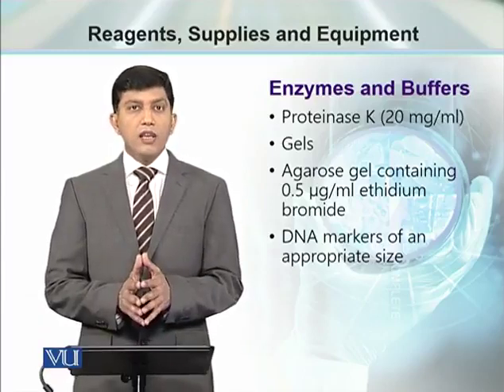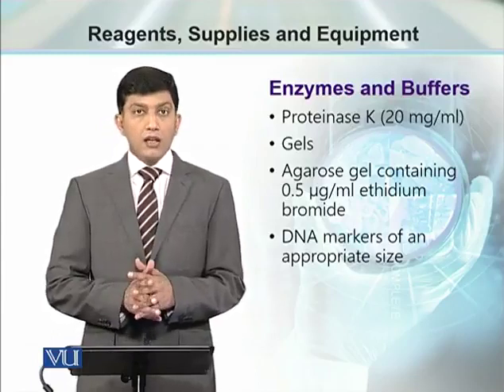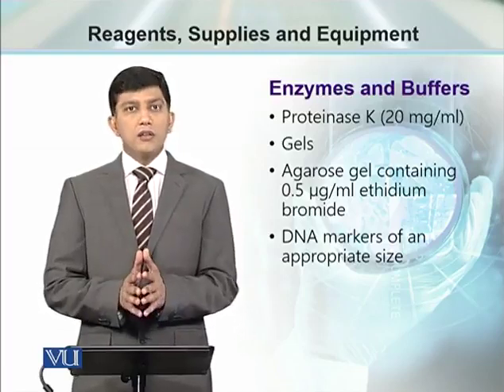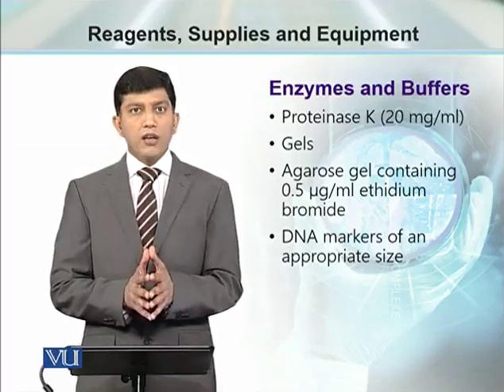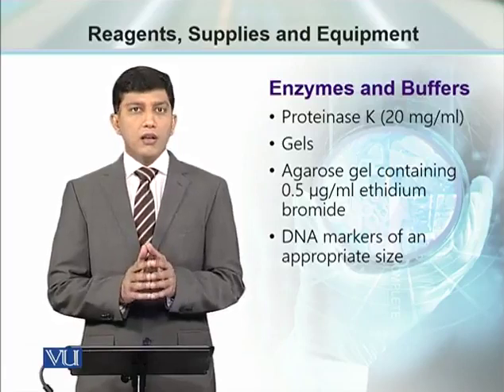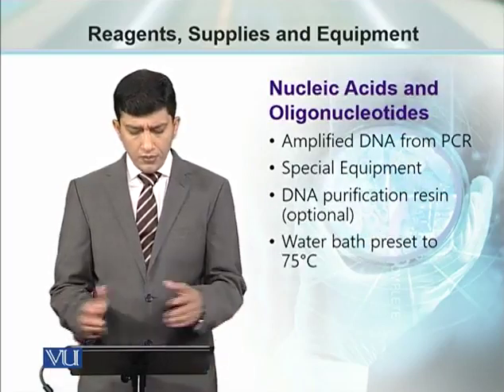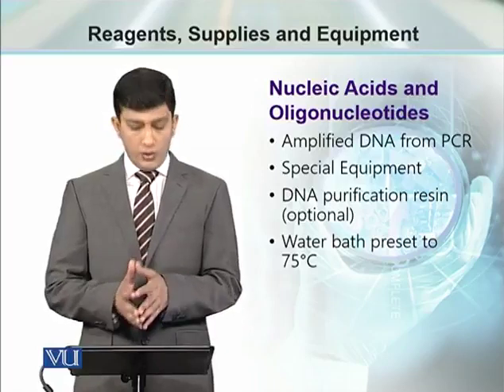Then we will need the gels, agarose gel, and the DNA markers are required. Agarose gel is going to be used in the presence of ethidium bromide to run the purified DNA sample, so as we can see if it is purified or some contaminations are still there. Then in the presence of DNA marker, we can determine the exact size of the amplified product. Then we need the PCR product which we have to work with.